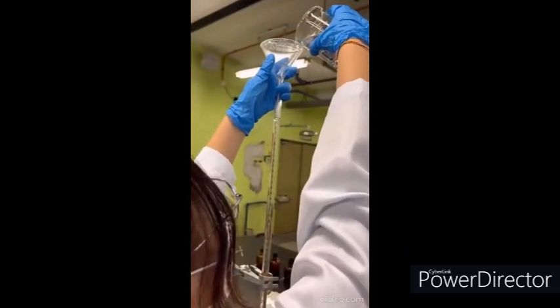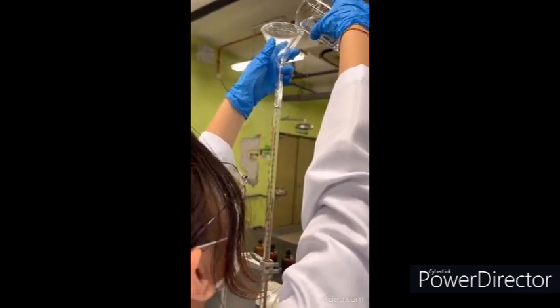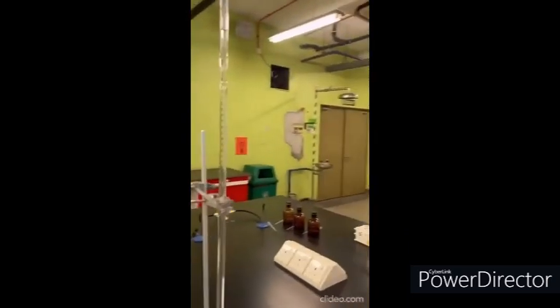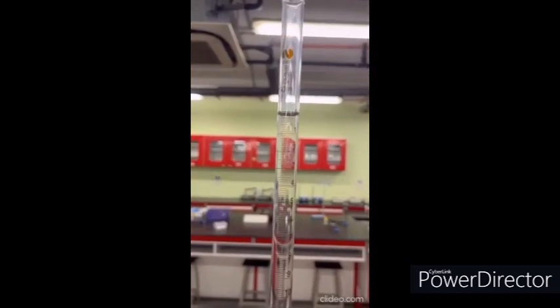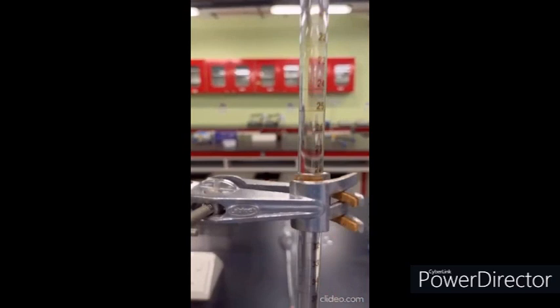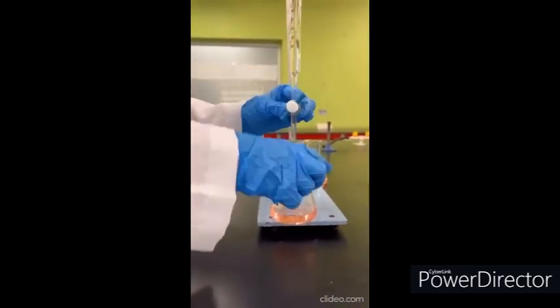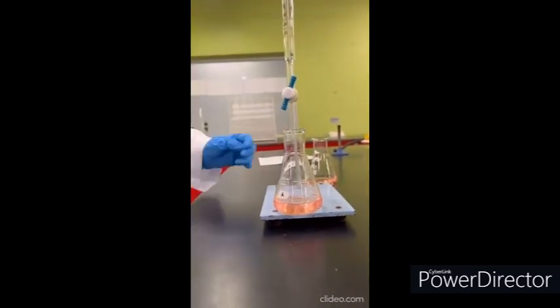Fill the clean burette with the sodium hydroxide with a concentration of 0.2 molar until it reaches the 0 mark, which indicates 50 ml of solution. Make sure that there is no air bubble in the burette and measure the initial reading. Then, place the conical flask under the burette and begin to titrate. During the titration, swirl the conical flask continuously to see the color change.